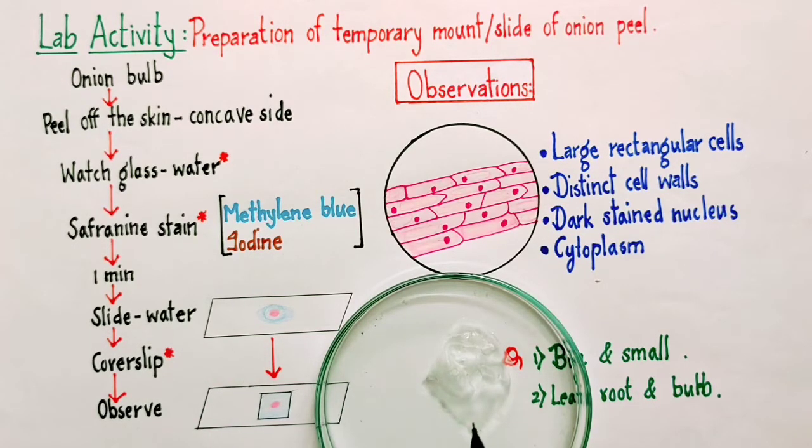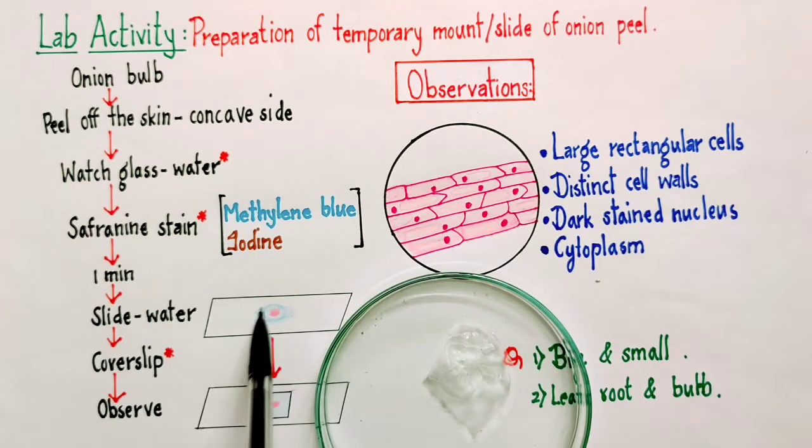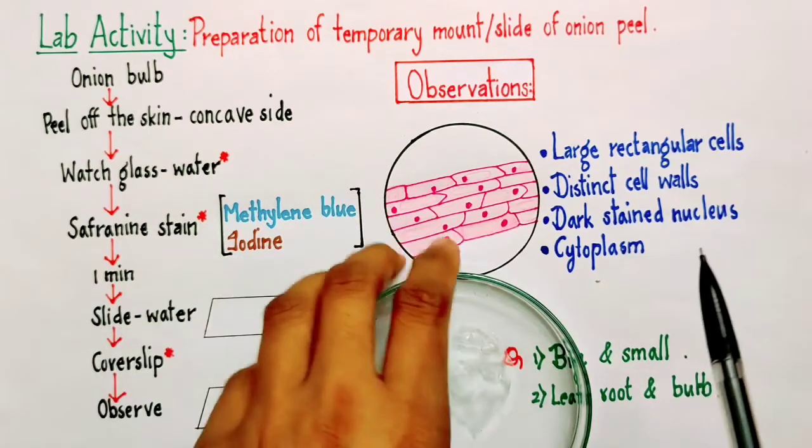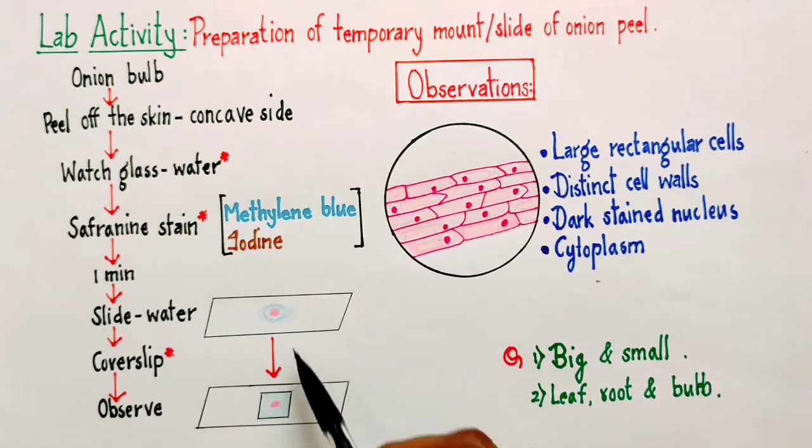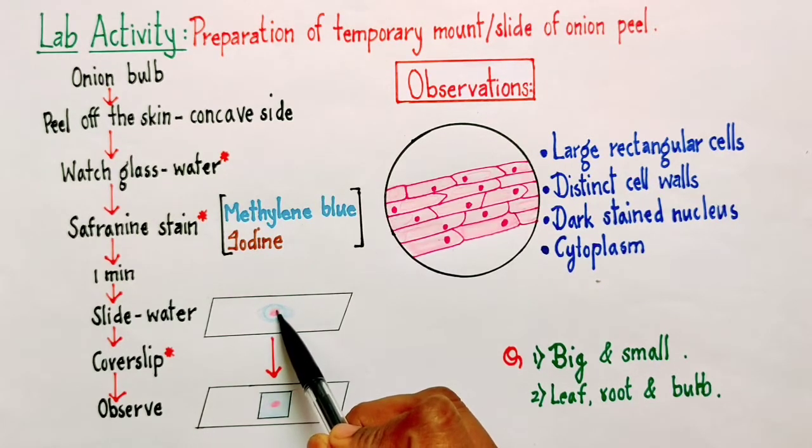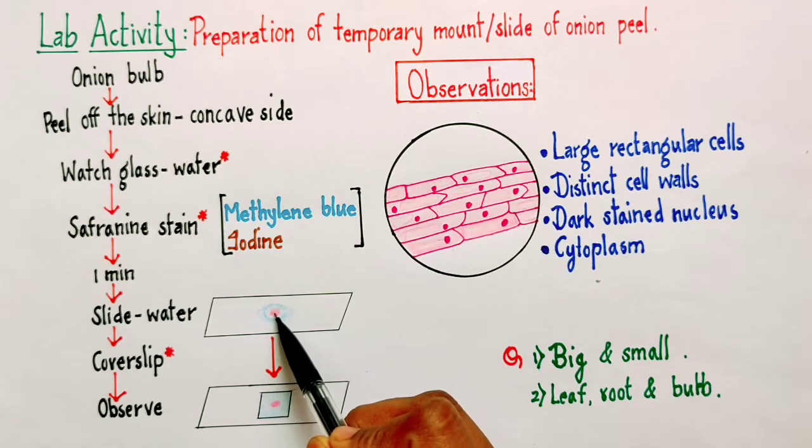After about one minute, we need to again take the forceps and cut it into small pieces and we are going to take a small portion of this, and then we are going to transfer it into a glass slide.